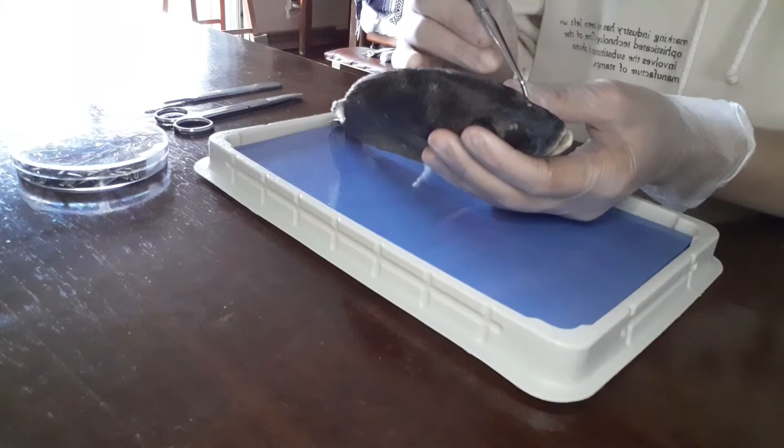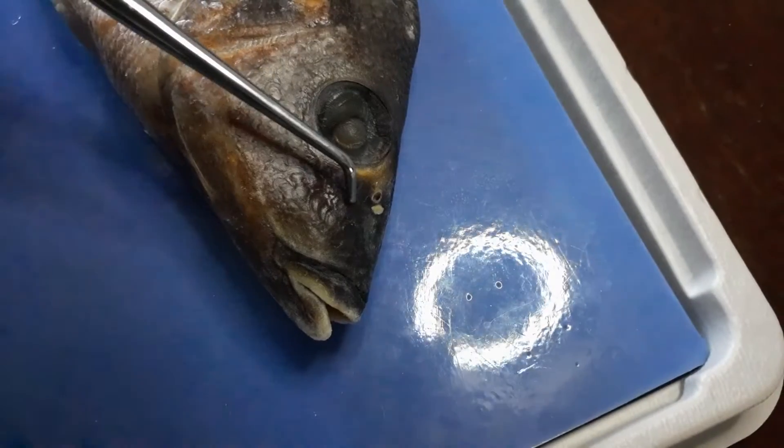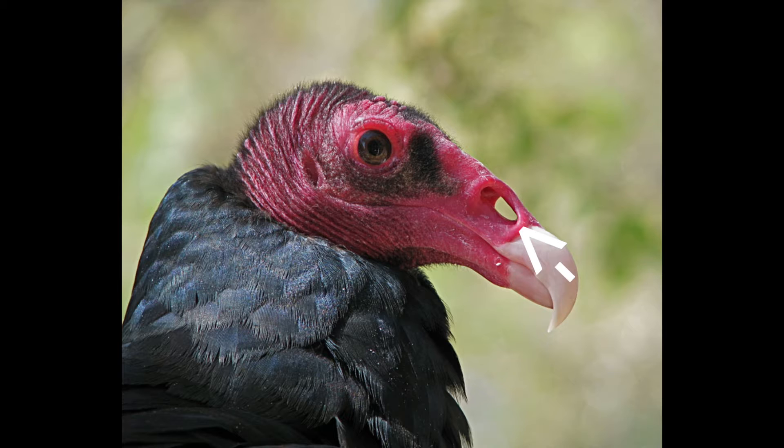Here is where the nares are located. This is the nares — it helps the fish smell for predators or even prey. Here are a few examples of nares from different types of animals.